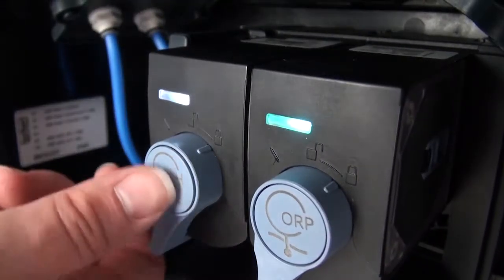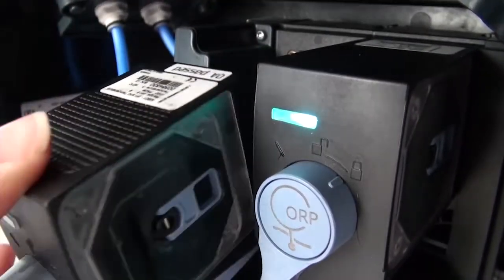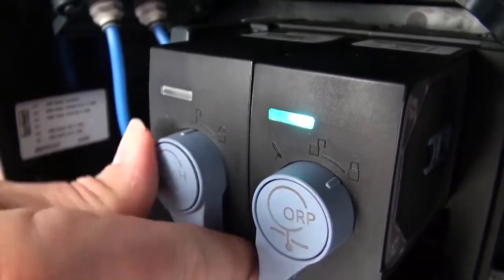Can the cubes be hot swapped in? Yes, very easily. There's a quarter turn — give it a turn, pull it out, put the second one in, quarter turn, and you're operational without actually stopping the process.